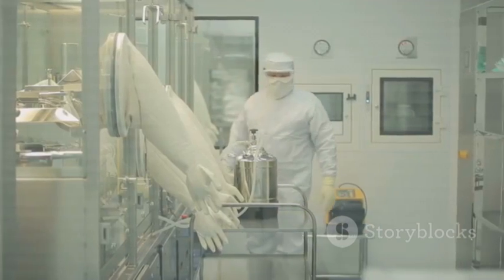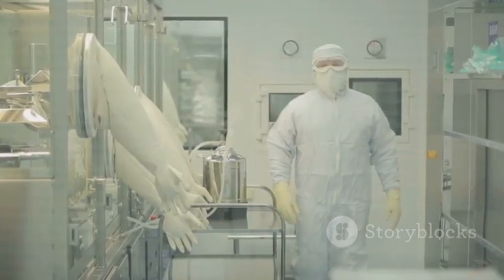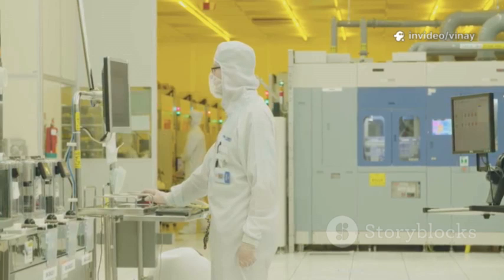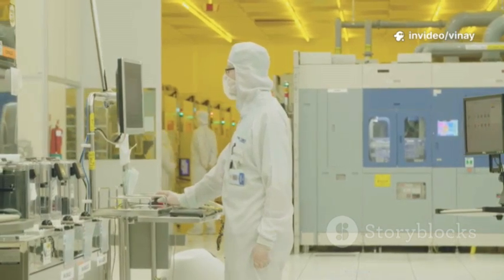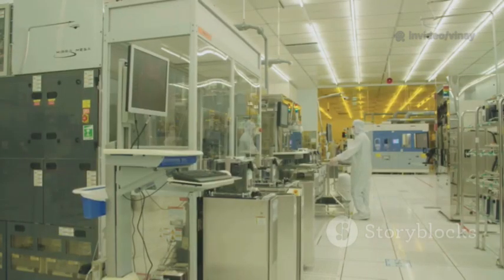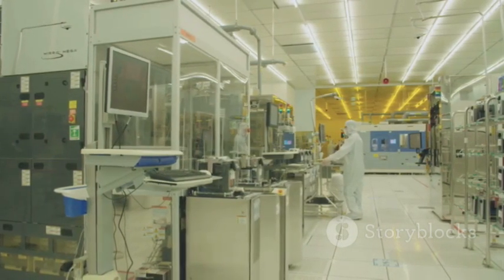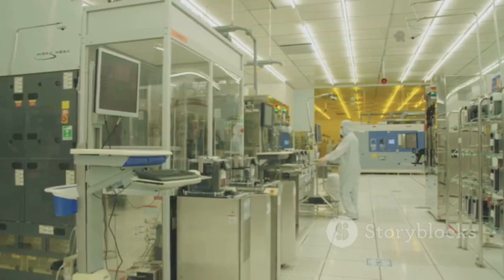Once inside the aseptic processing area, operator conduct is rigidly controlled. Movements must be slow, deliberate, and minimized to reduce the generation and dispersal of airborne particles. Rapid motions create turbulence in the unidirectional airflow, potentially drawing contaminants into the critical Grade A zone.